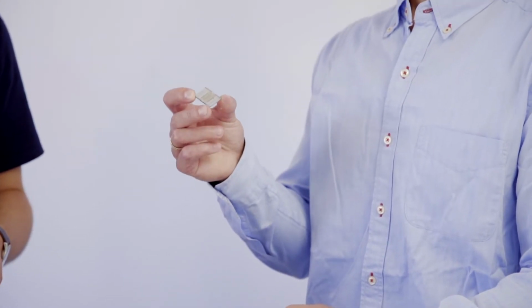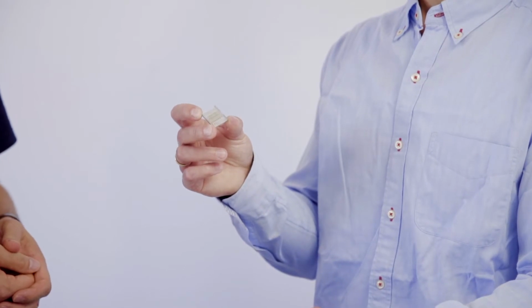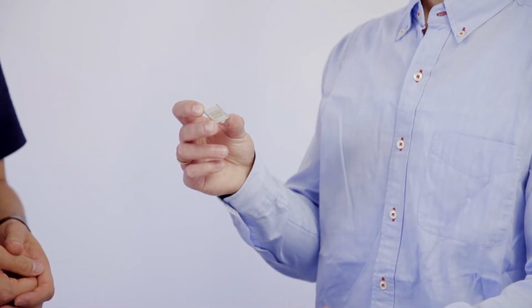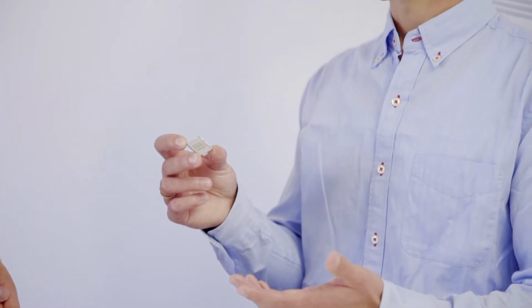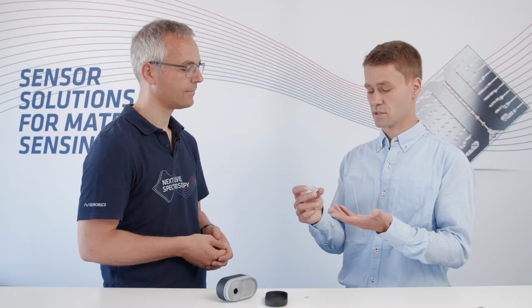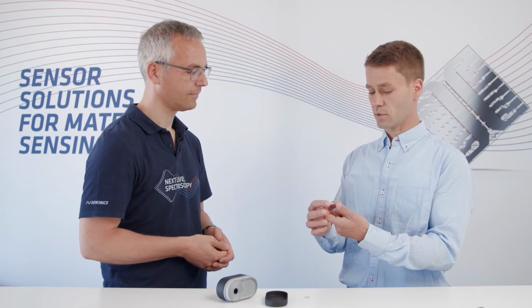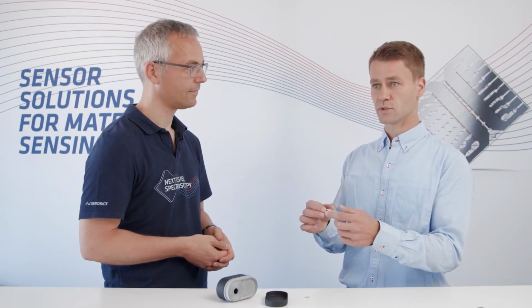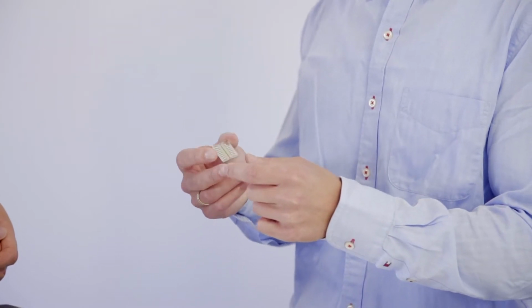We have different spectral region coverage here. So we have individual pixels which are responsible for individual spectral regions. And we have no moving elements. We have no additional optics required to take a spectra. And therefore, this is regarded as a low-cost sensor. It is very, very fast, because there's no moving element, and these are standard PIN diodes, so we can measure really, really quick.